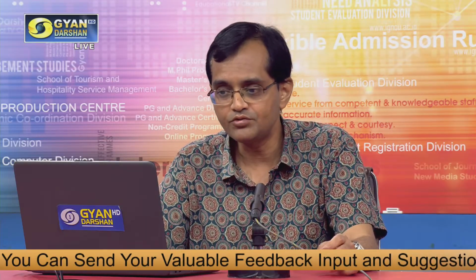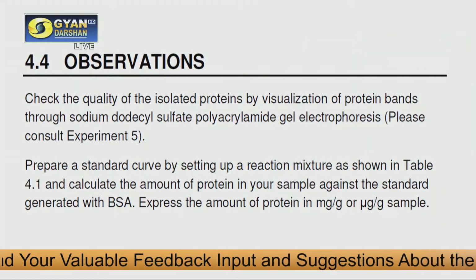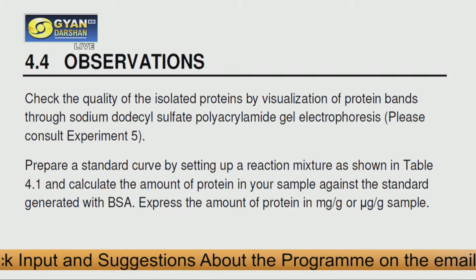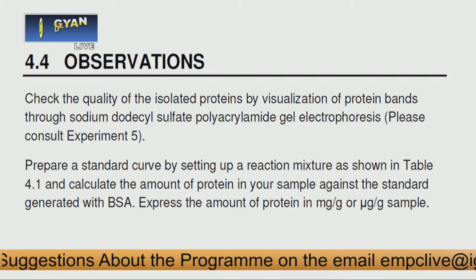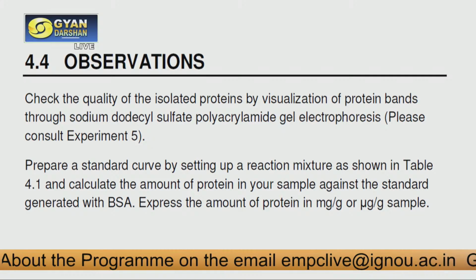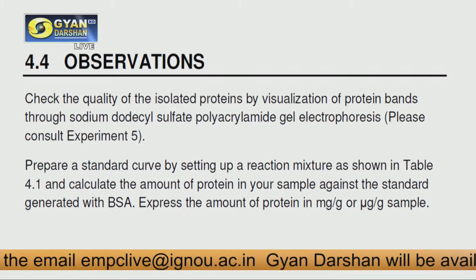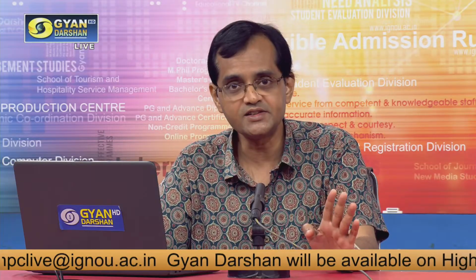So you have to check the quality of the isolated protein by visualization of protein bands through sodium dodecyl sulfate polyacrylamide gel electrophoresis, which will be our next experiment and the last experiment for today. So that is the qualitative part.